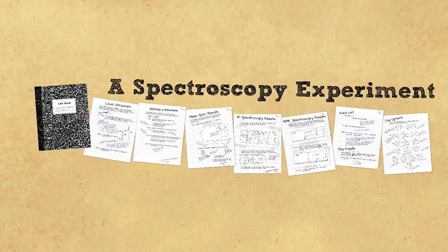So with various two-dimensional NMR techniques, you will be able to determine the exact connectivity network within a molecule, and you wonder why I taught you IR spectroscopy at all. But you'll still have to know it for the final exam. So the emphasis in this course will be on NMR, because as an organic chemist, it is the go-to most useful instrument on planet Earth. IR spectroscopy is important as well. Why? Because it's on your bench.